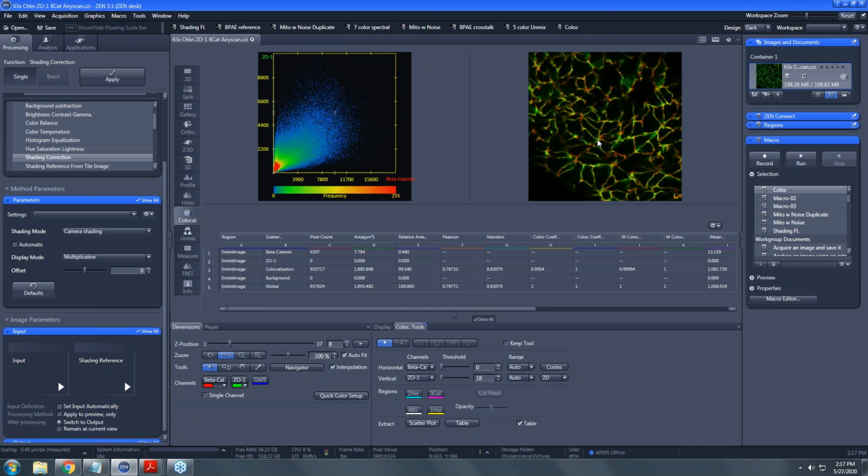So what do we do for thresholding here, Nicole, on the background? Do you remember what it was? Maybe a 1,000, something like that? Yeah, I think we went with either 500 or 1,000 last time. Okay. So if we set our threshold, this is one way to do this, and it's a very dirty way to do it to start with.